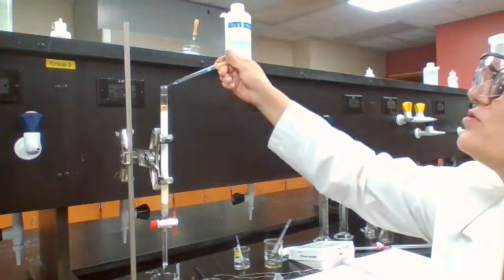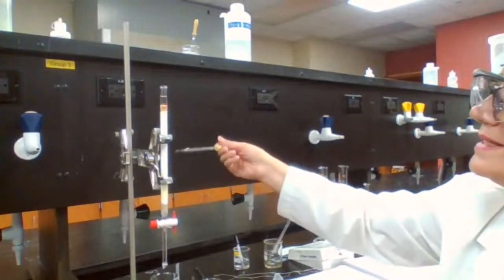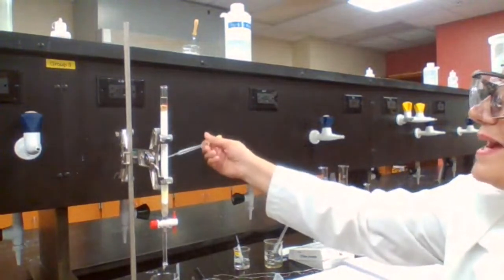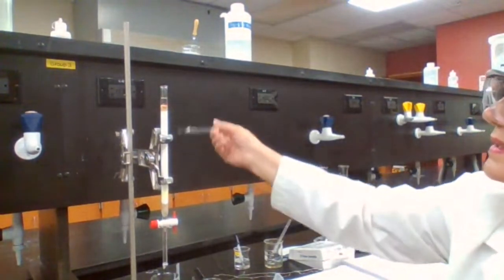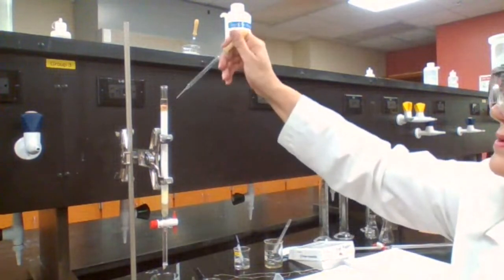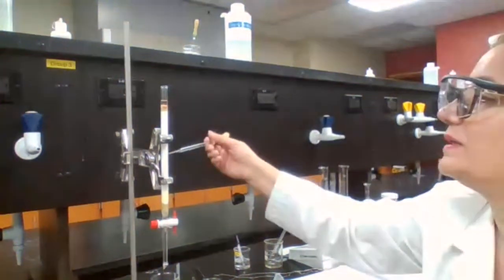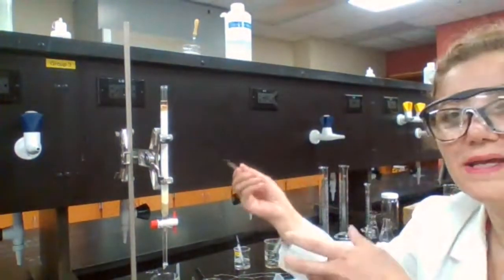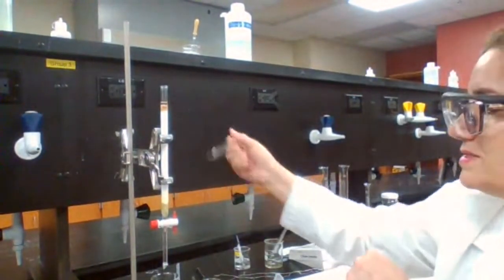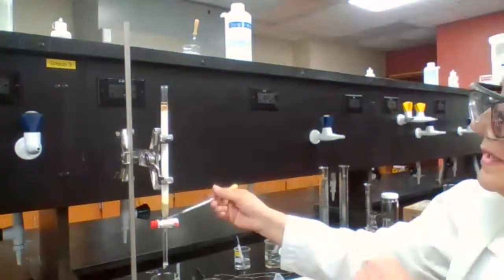It should never get dry. And you notice at the beginning, I add the hexane first before adding the alumina, because I didn't want any cracks, any gap in the column. So if I put no liquid, or if I leave this area dry, when the alumina gets dry, it will crack, and then you have a gap. Then the separation is not going to be efficient. So the yellow color is all the way down here.